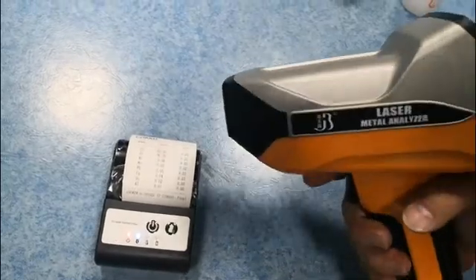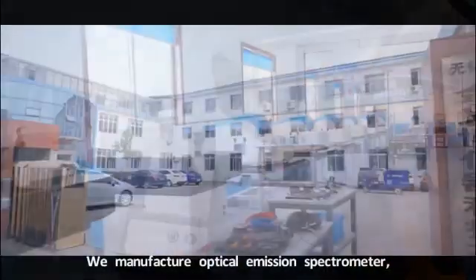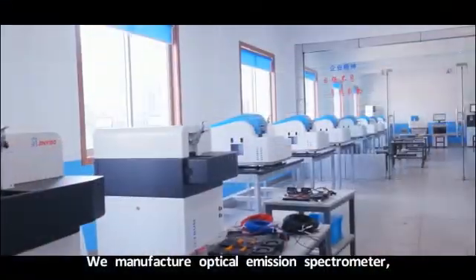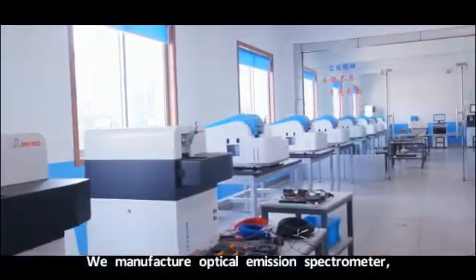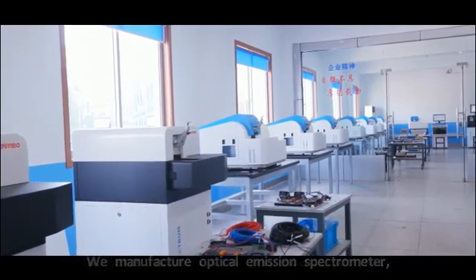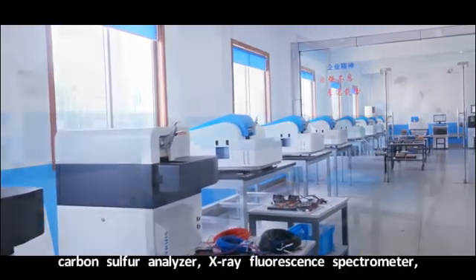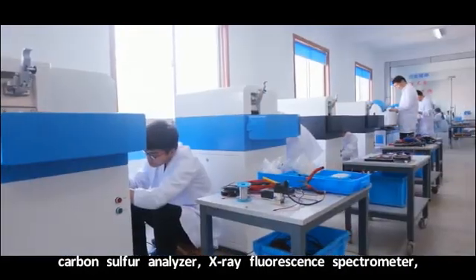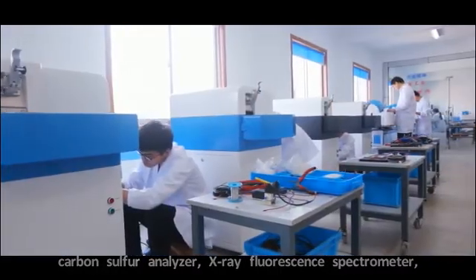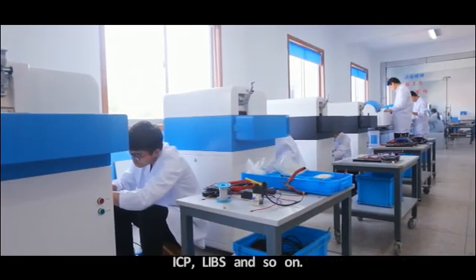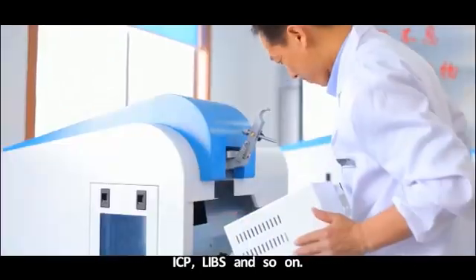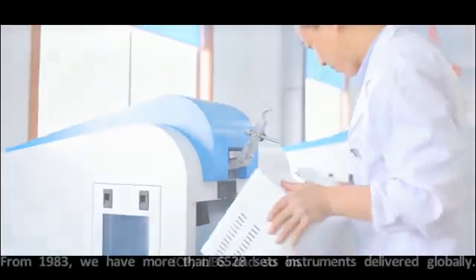This is our company. We manufacture optical emission spectrometer, carbon sulfur analyzer, x-ray fluorescence spectrometer, ICP, and so on.